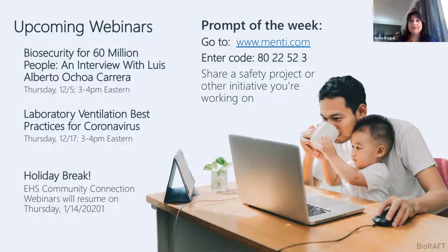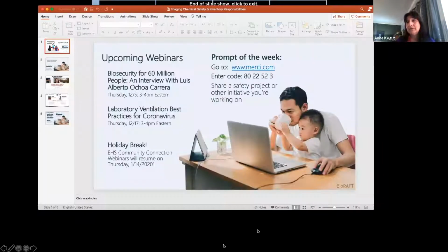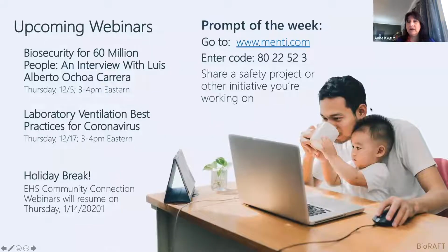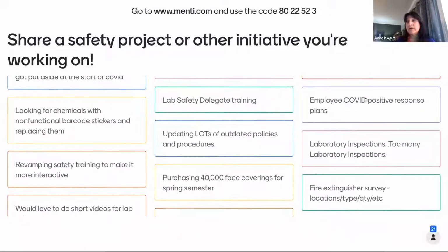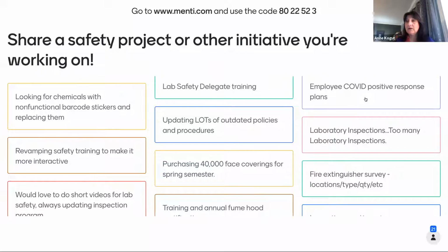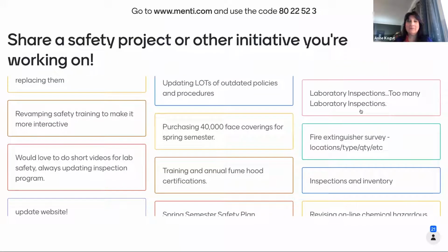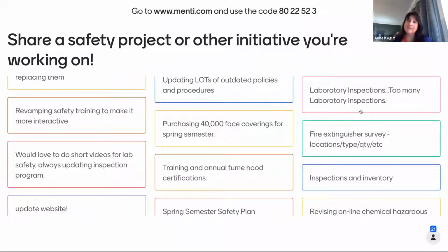However, because some labs are having a difficult time finding nitrile gloves, if they need it for their work, they're able to go there, and that really eliminated the possibility of people not getting the right disinfectants, the right cleaners, and the right PPE. And so we are managing that as part of the PPE Store, as part of our supply specifically for the COVID response, which has been very well received because it doesn't cost them anything. It's on a different budget, but we're trying to make sure we have the right supplies to everybody.